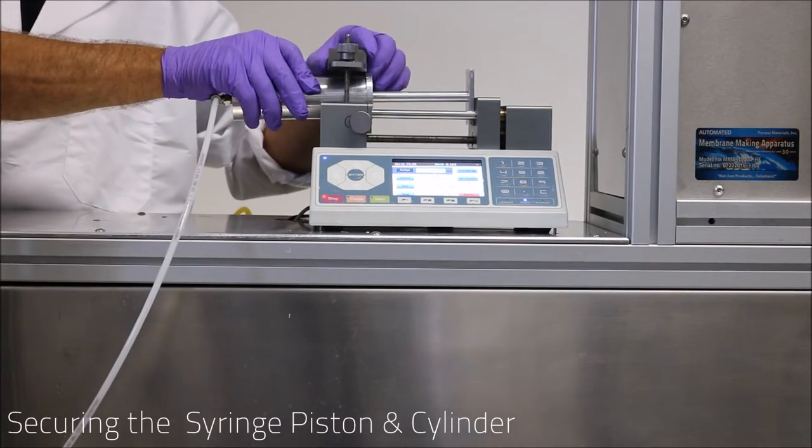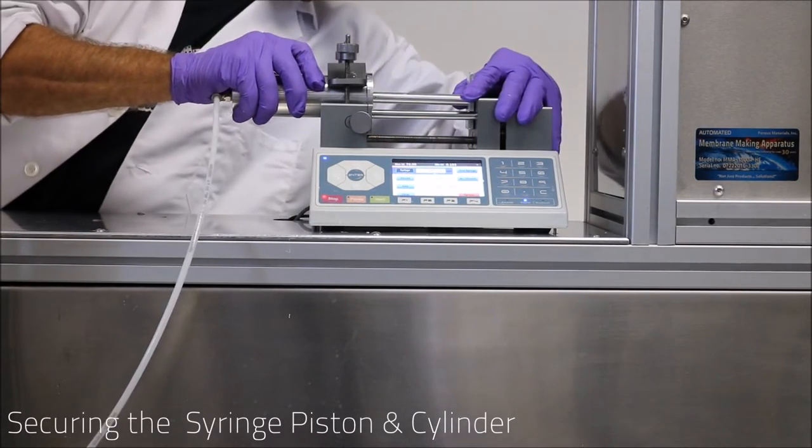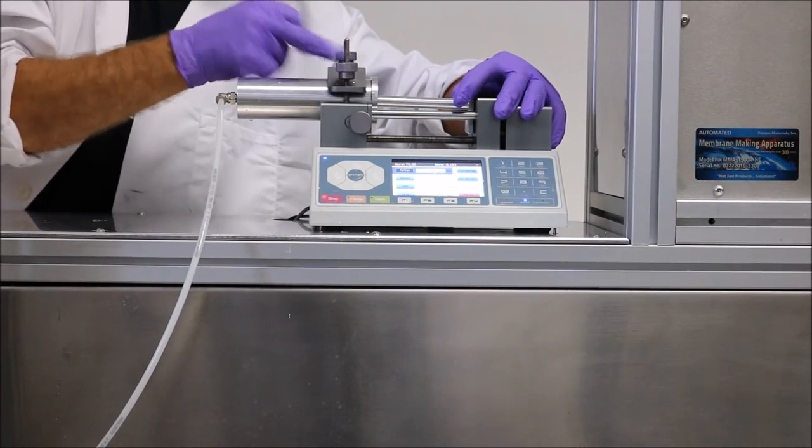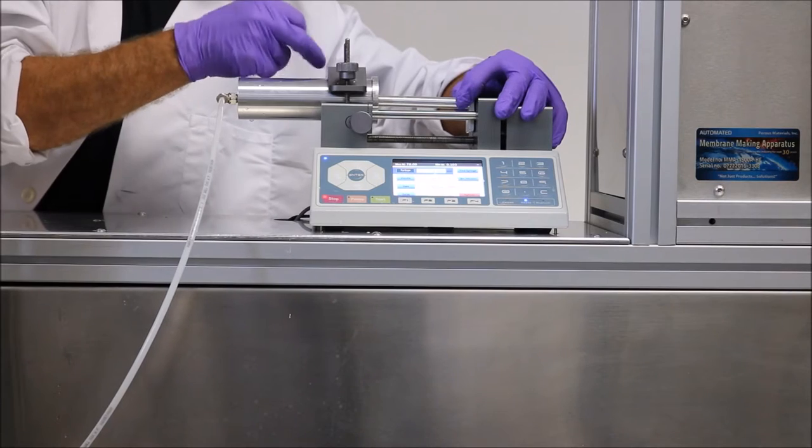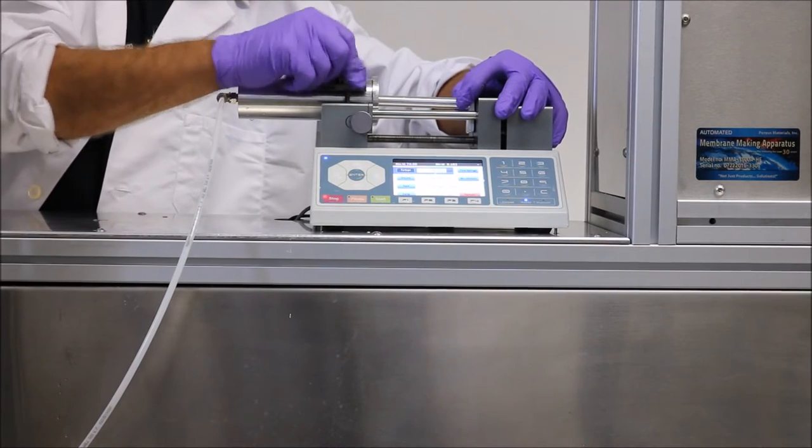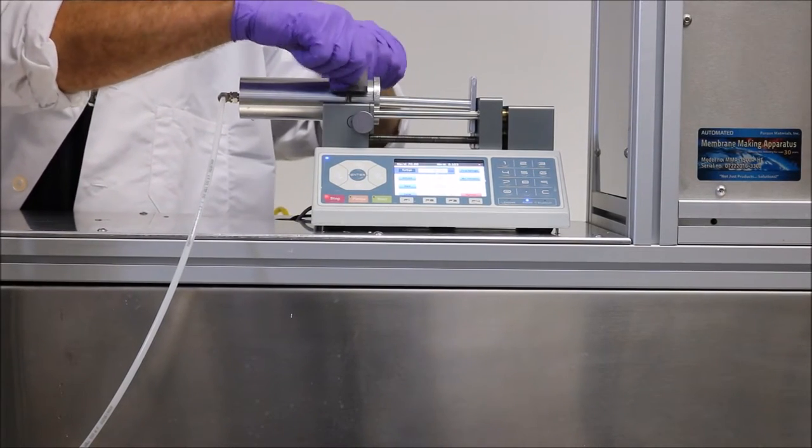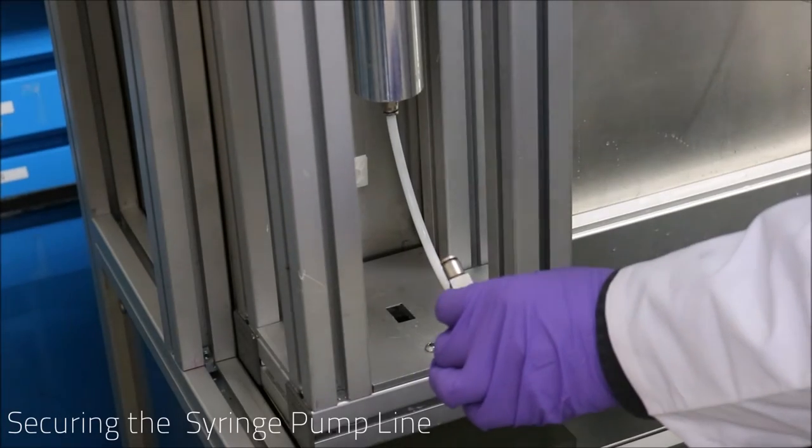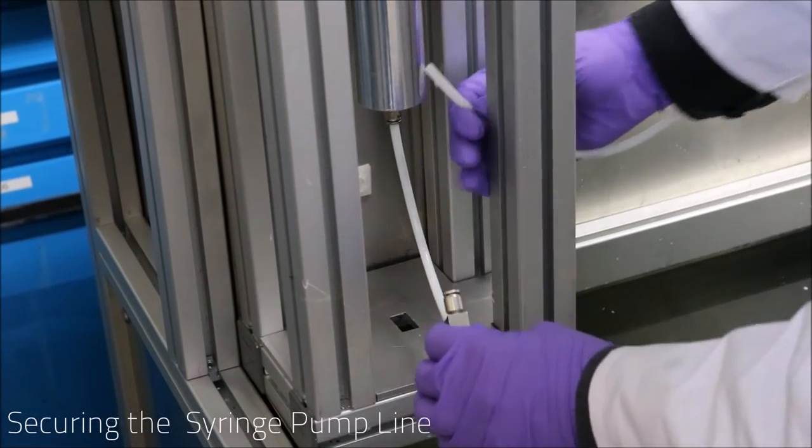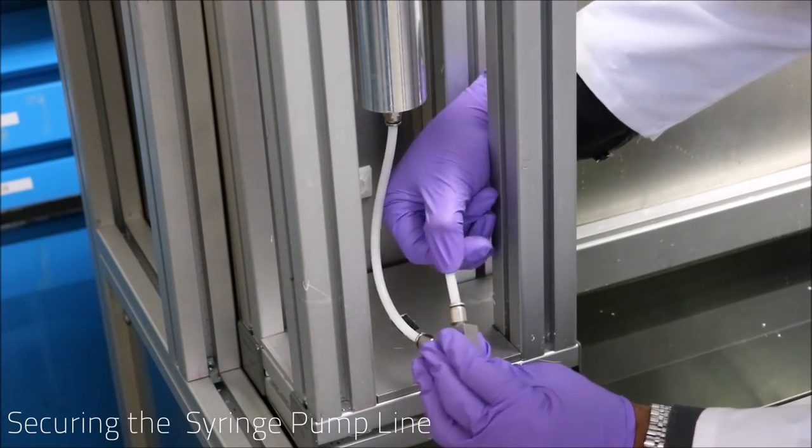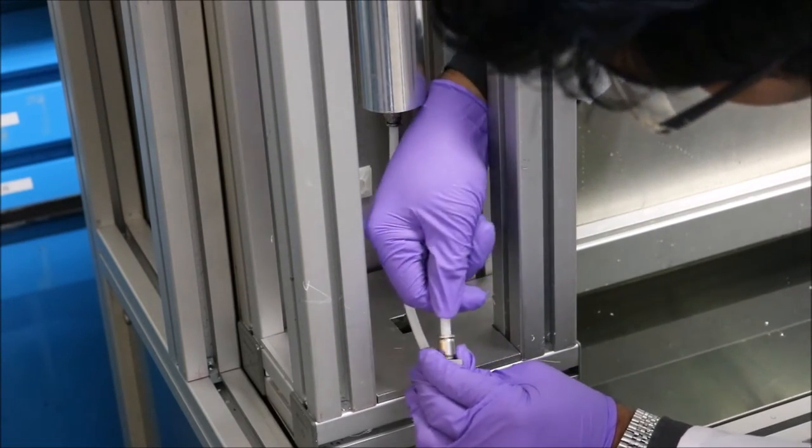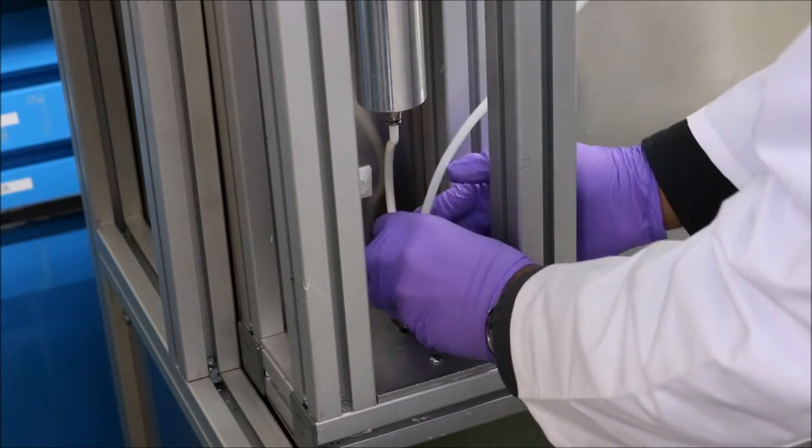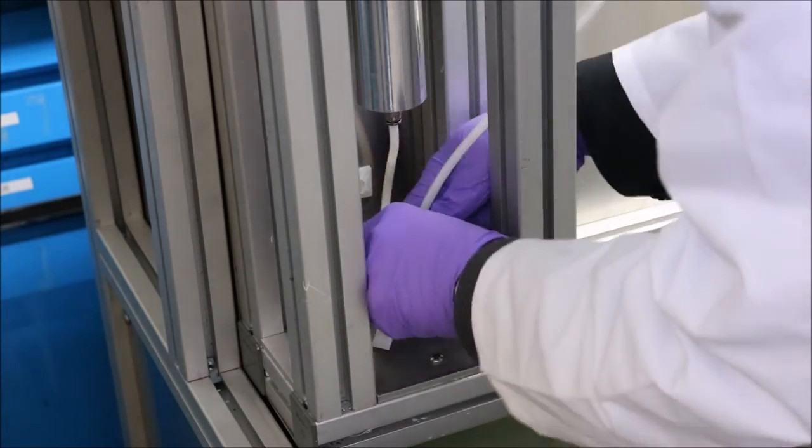Now we need to secure the syringe piston cylinder onto the syringe pump. Insert the piston into the cylinder of bore solution, then place the assembly into the vise of the syringe pump and tighten accordingly. Next, secure the line from the syringe pump into the quick connect fitting on the dispensing nozzle. Make sure it is seated properly in its mounting slot.